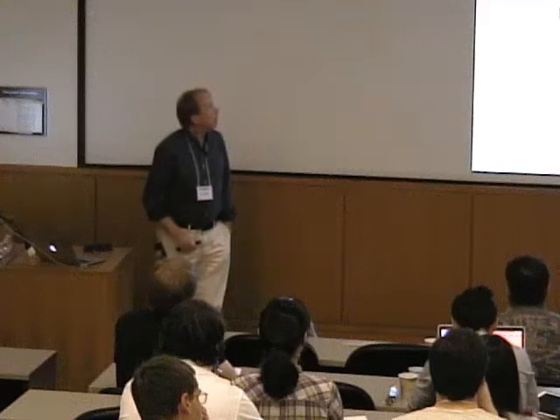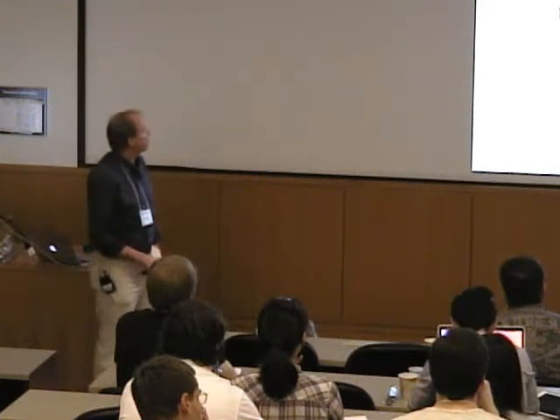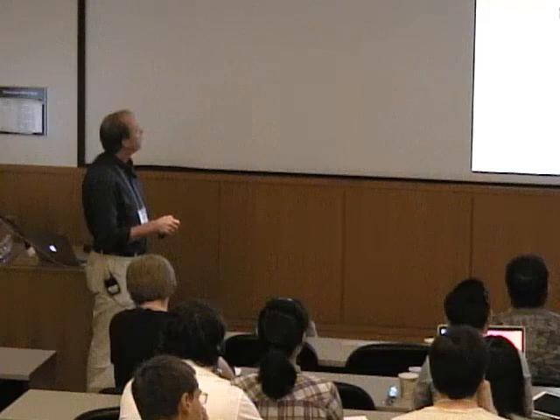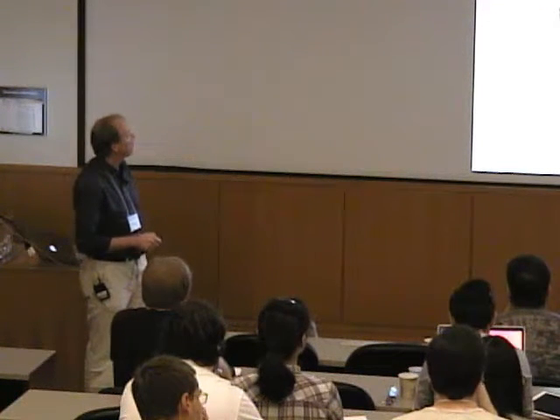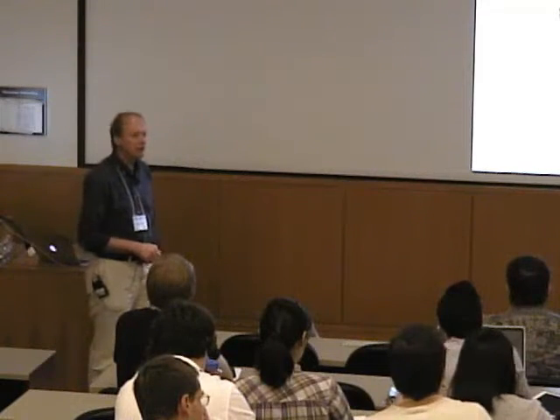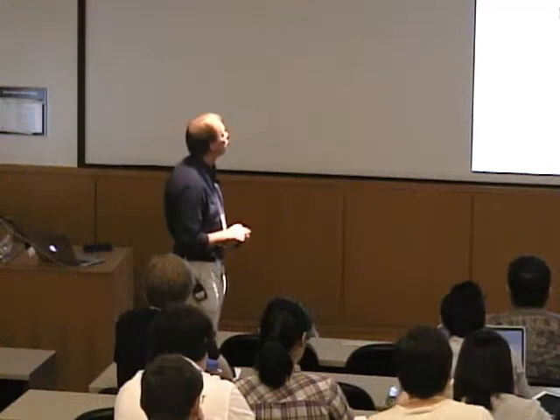All right. John mentioned some chapters. Here are some references, some places where you can find information which goes beyond what we can do here today. There's this book by Hagen, which came out in 2009, called Biomolecular EPR Spectroscopy. This is a great book for someone who's not an expert and doesn't have a really strong background in physics. It starts at a very qualitative level and talks about really practical things like how do I prepare my sample, how do I put it in the spectrometer and tune it. But it progresses, and in the second half of the book, there is lots of theory if you want to learn more details. So this is a really good book.